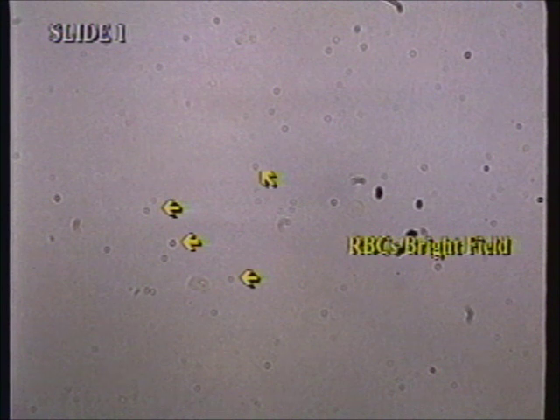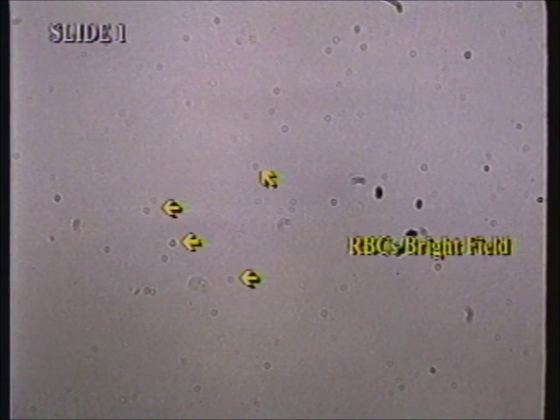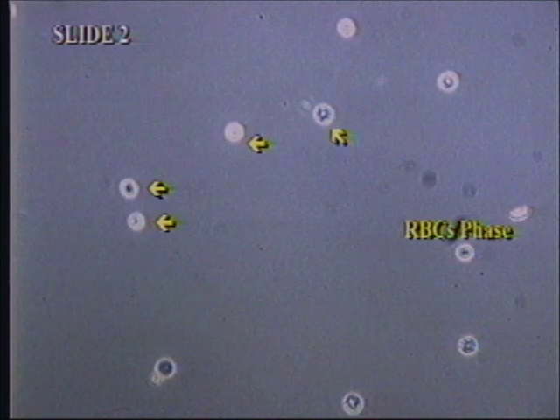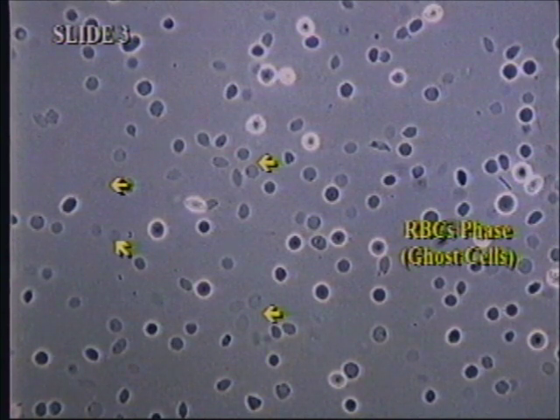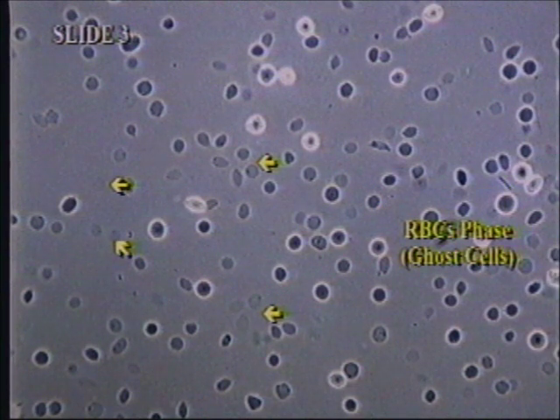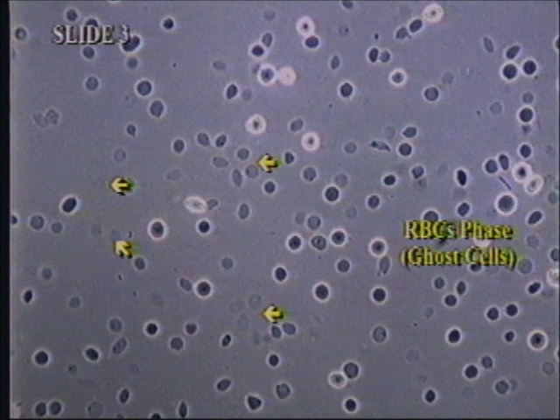In the what section, we will do a quick review of the common elements seen on routine microscopic examination of urine. The first structures we will look at are red blood cells. In this slide we see many red blood cells using routine light microscopy. In this slide we see many red blood cells under phase microscopy — you can certainly see the advantage of using a phase microscope. Under high power phase, we see something that is frequently missed under brightfield: ghost red blood cells. Without phase, the numbers reported would not be as accurate because of all the missed ghost cells.